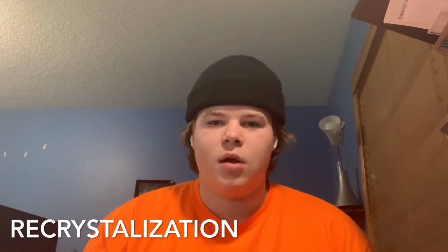Now, I will be giving a summary of all the purification and characterization techniques taught in the organic chemistry lab. The first technique I'm going to be covering today is recrystallization. This is known to take impurities out of a solid. The process of a recrystallization is to first choose a solvent that dissolves your solid only a little bit at low temperatures and then very well at high temperatures.